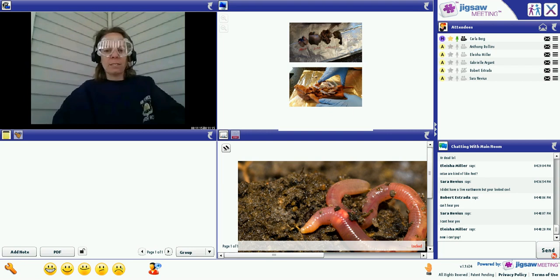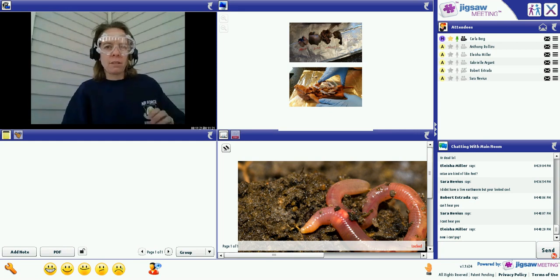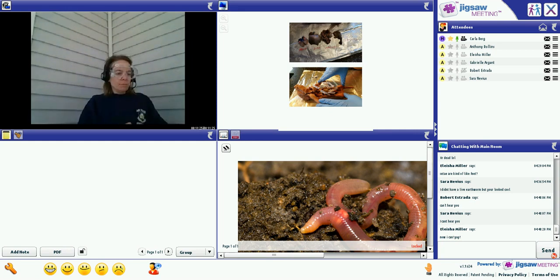Once your worm is open, go ahead and click yes. Or once your worm is cut. Okay, and remember, we're taking it slow. So once your worm is cut, click yes. It does not have to be open yet, just cut.